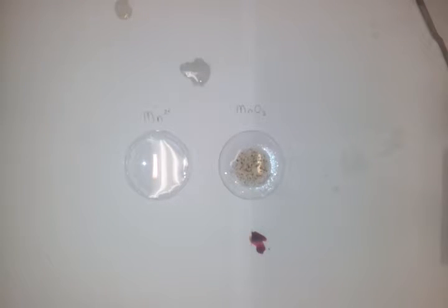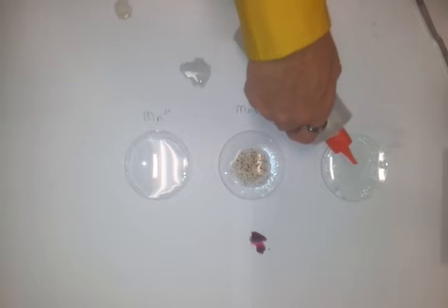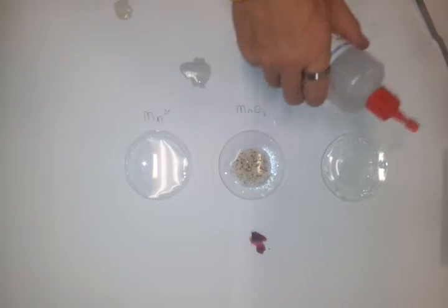Third time lucky. The joy of chemistry doesn't always work well, especially when you're videoing. So, as I say, third time lucky. Let's see if we can get it to work. So there's still a little bit of peroxide in there. I'll just add a drop more.